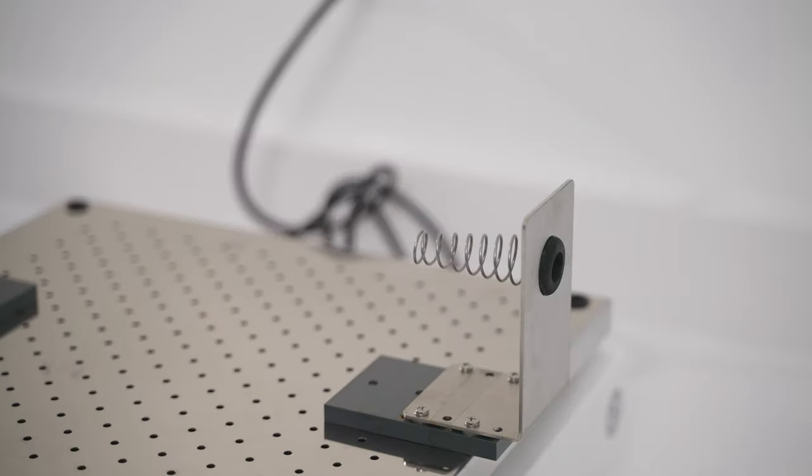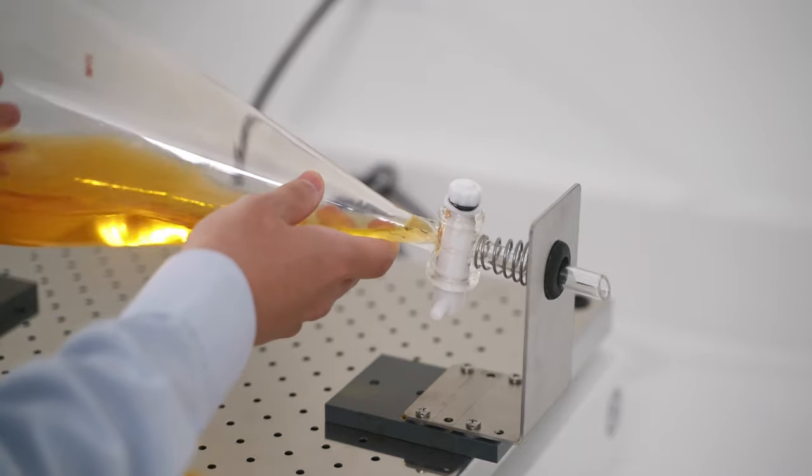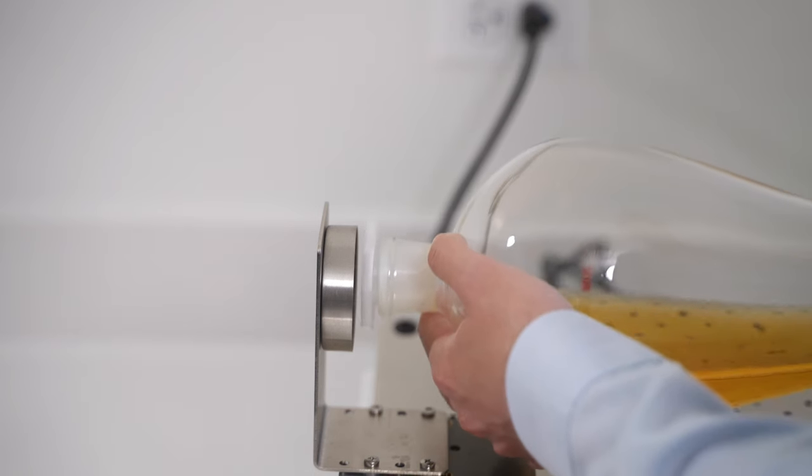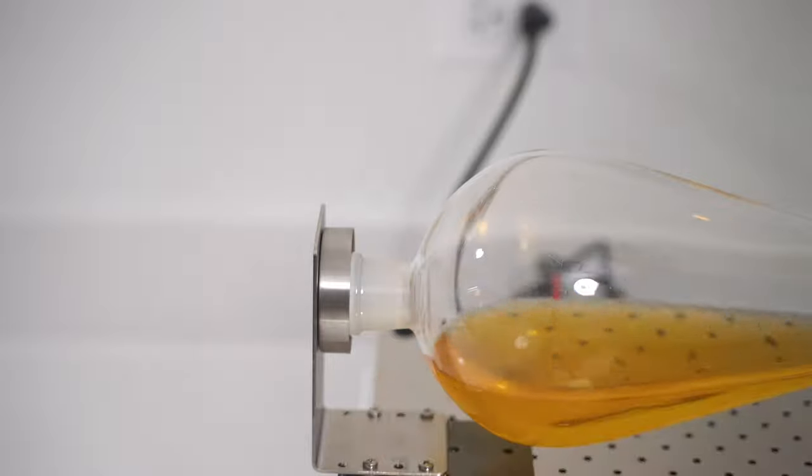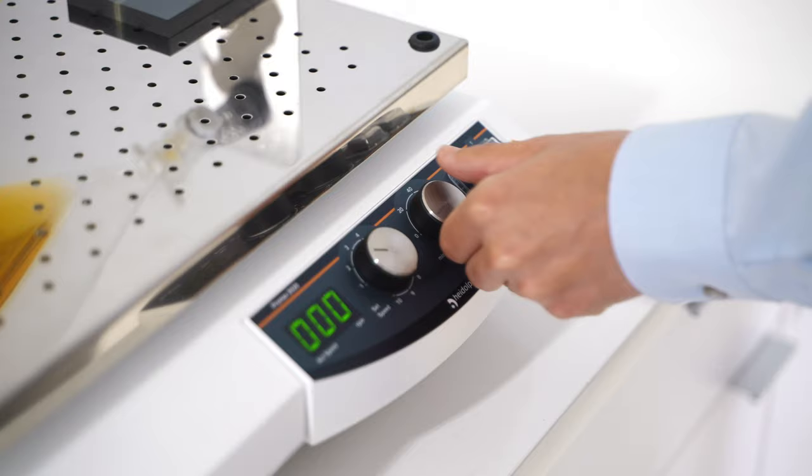Once the two clamps have been fitted at the correct locations, the separatory funnel can be fitted by pushing the stopcock end of the separatory funnel into the spring. Once pushed in, the stopper end of the separatory funnel can be placed securely into the other clamp. From there, you just need to put in the correct speed settings and time settings.